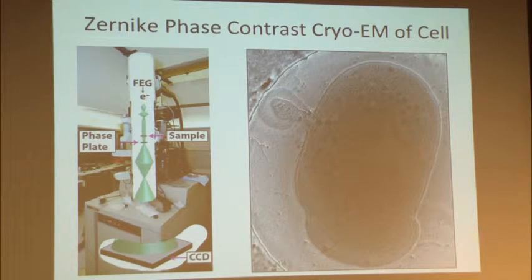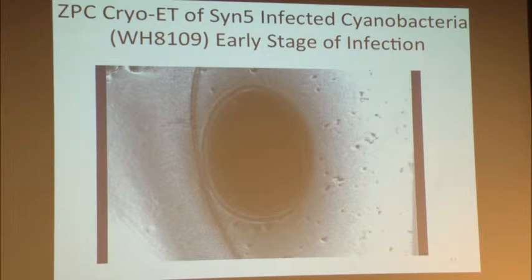This concept was conceived a long time ago, but had not become practical until more recently because of the proper material choice, and I think people now have the proper nano device and nano fabrication technology. Using the phase plate is absolutely beneficial in that kind of environment. Anyway, we do this by tomography because no two cells are identical. We cannot do 20,000 cells to average. We do a 3D reconstruction for each cell.